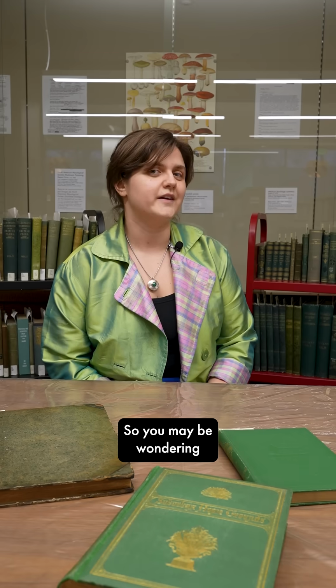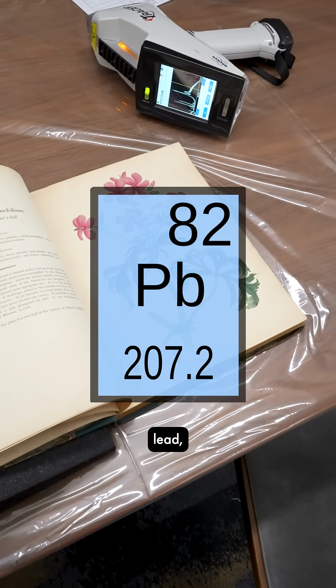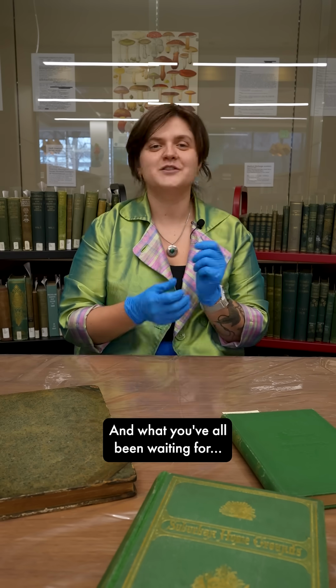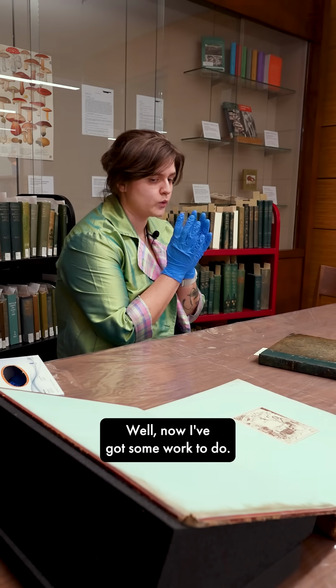So you may be wondering, what elements have been panicking at our disco? Well, lead, mercury, lead, chrome, did I say lead? And what you've all been waiting for, arsenic. Well, now I've got some work to do.